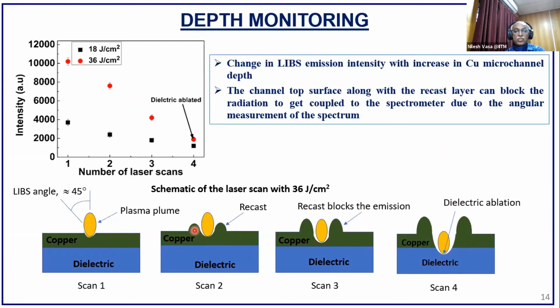However, subsequent micro manufacturing of such micro-scribing will be done under certain other medium which will allow simultaneous etching when the laser ablation is taking place, and that too we are using a salt solution, so that laser ablation along with the salt solution provides a selective etching of the copper film alone when we reach very near to the region where the scribing depth is achieved. So this is our idea.